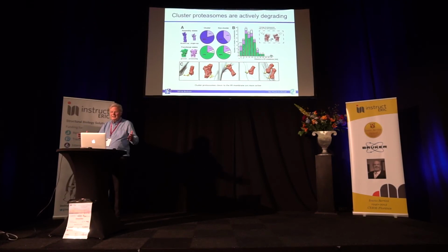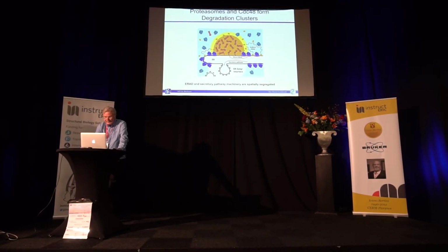So tentatively, this is substrate that is being extracted from the ER, but there's a lot of heterogeneity because the substrate is not just a single molecular species. So that is basically a schematic of how we see the ERAD cluster.